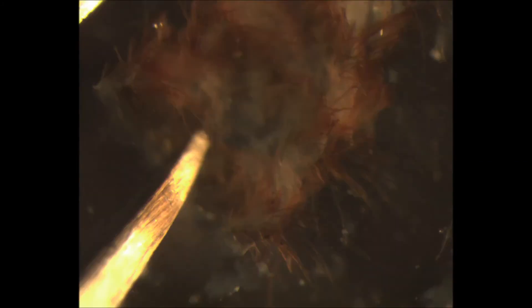I can just use the hypodermic needle to take it out. Here is the abdomen tip. I'm going to take the setae off one side of that with a minutien pin so we can look for those sutures.